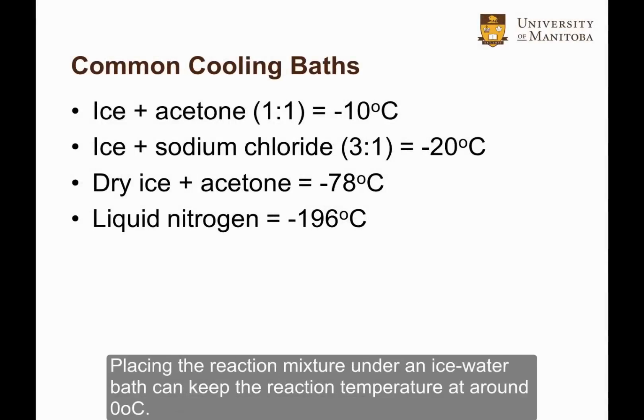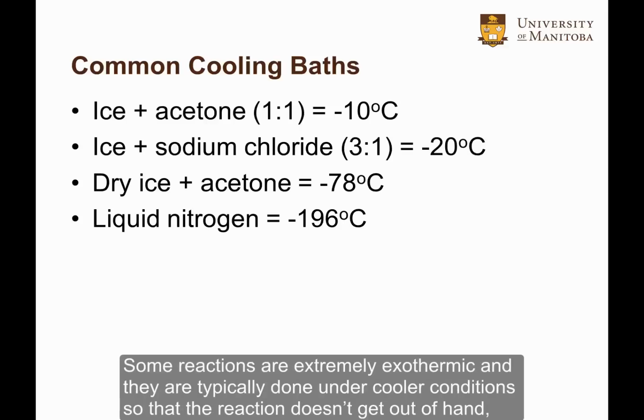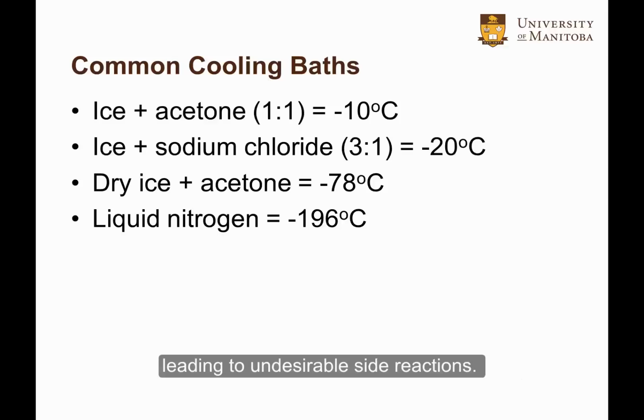Placing the reaction mixture in an ice water bath can keep the reaction temperature at around 0 degrees Celsius. However, with mixtures of various organic solvents and dry ice or liquid nitrogen, other sub-zero temperatures can be achieved. Some reactions are extremely exothermic, and they are typically done under cooler conditions so that the reaction doesn't get out of hand, leading to undesirable side reactions.